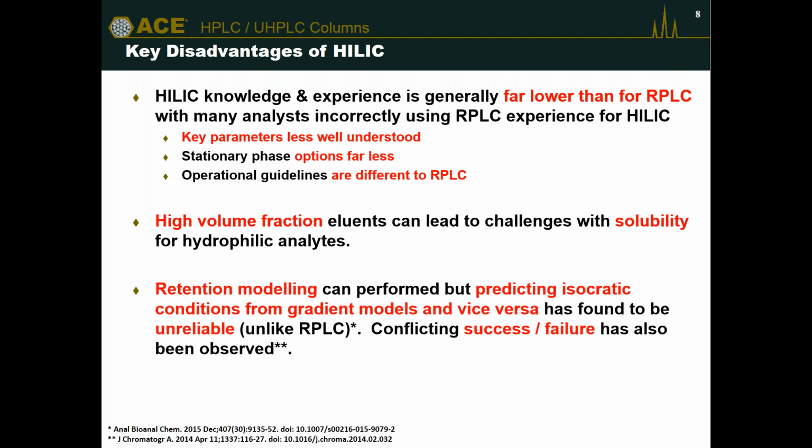And finally, should you be interested in retention modeling and predictive modeling and retention time predictions, the experiences so far have been mixed with HILIC as a technique, and these have been published in the literature by a variety of scientists, where sometimes HILIC predictions have worked well and other times they've worked not so well. So this is still something that's being explored.